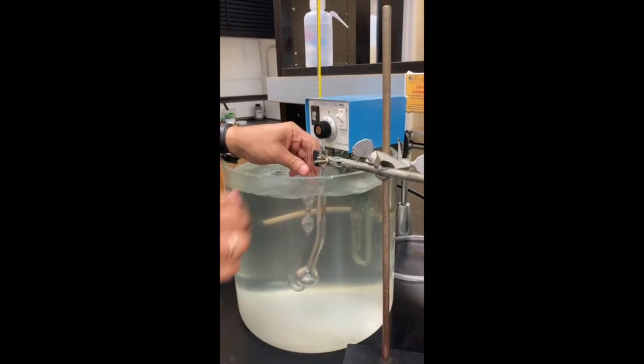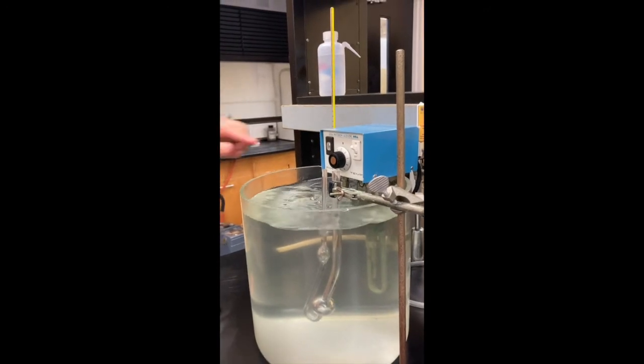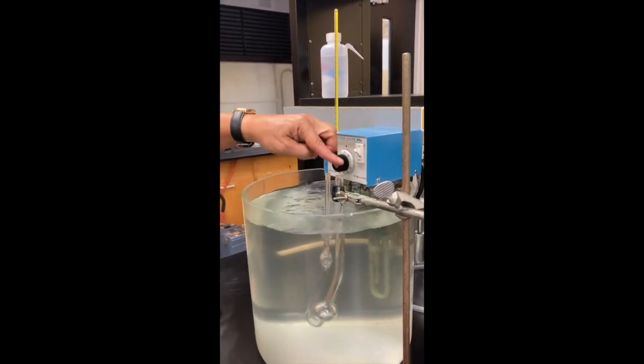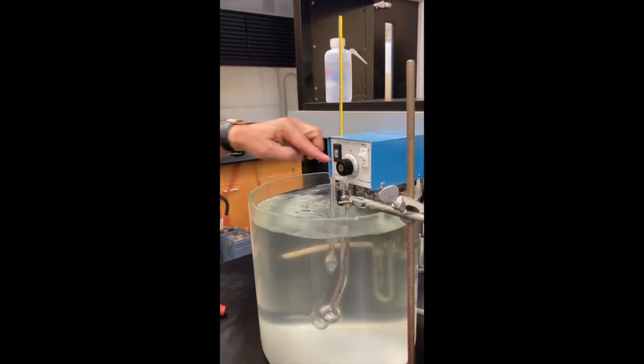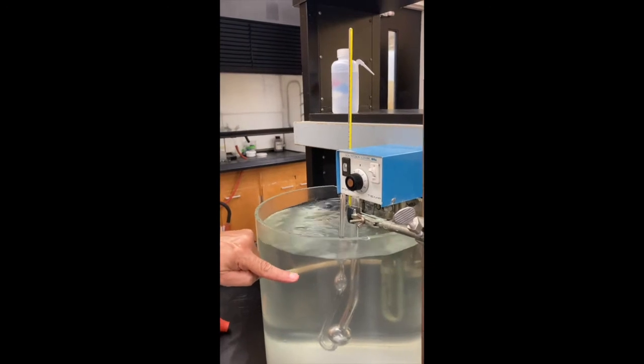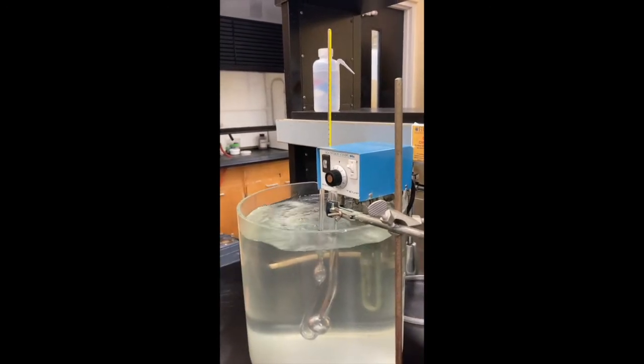So now we are ready for measurements. We will pour our water here, then suction it above the upper fiducial mark, let the liquid flow, and take the measurements.